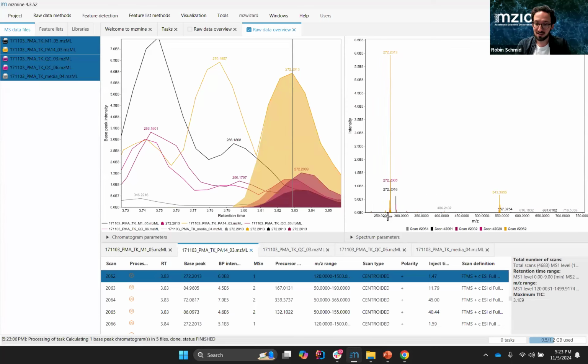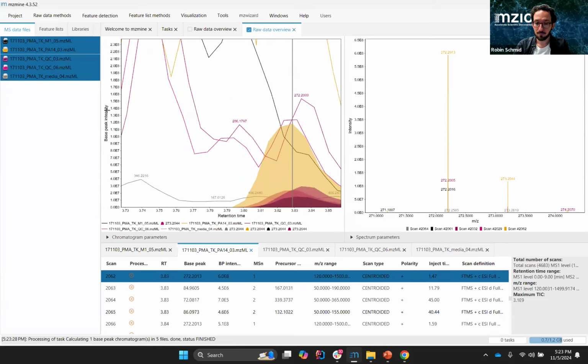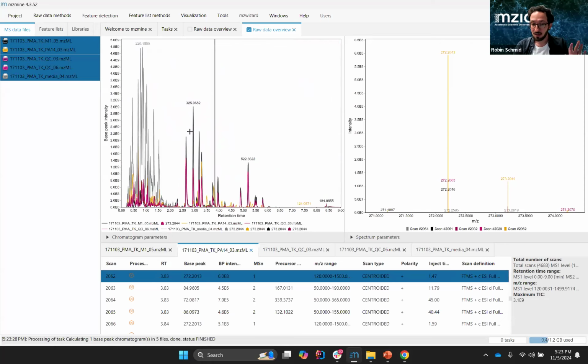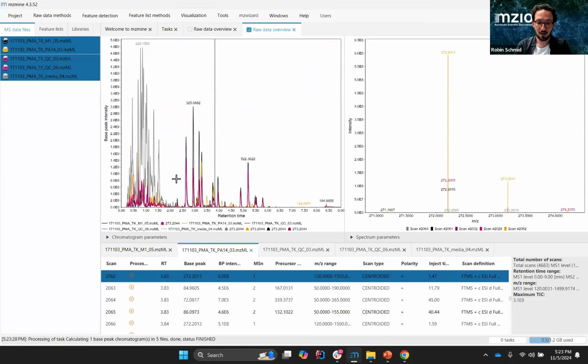And if I want to extract another signal, I could also zoom in and, for example, look if the isotope is also at the same retention time. And of course, by just clicking on the isotope, I also extract the extracted ion chromatogram of this isotope. We can already see there's not much of a retention time shift. We have plenty of data points on each peak. Despite using data-dependent acquisition here, those peaks are actually quite nicely resembled.